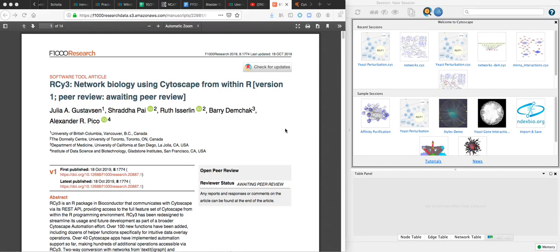This is Cytoscape 372, and we're going to be looking at an RCy3 use case from the F1000 research paper. RCy3 is the Bioconductor R package that allows you to connect to a local running instance of Cytoscape from within R.